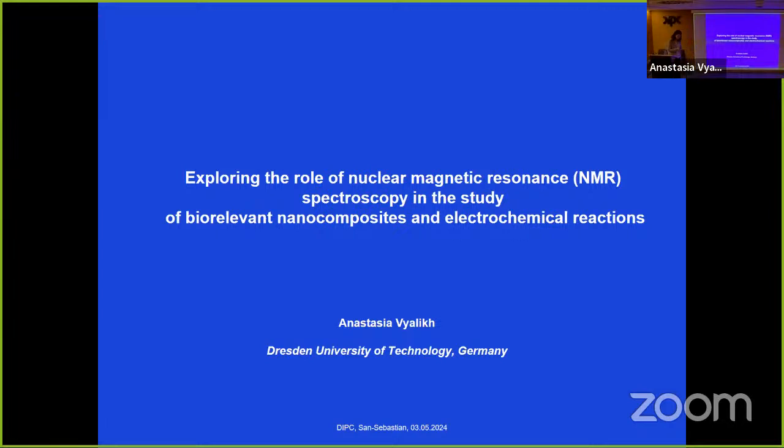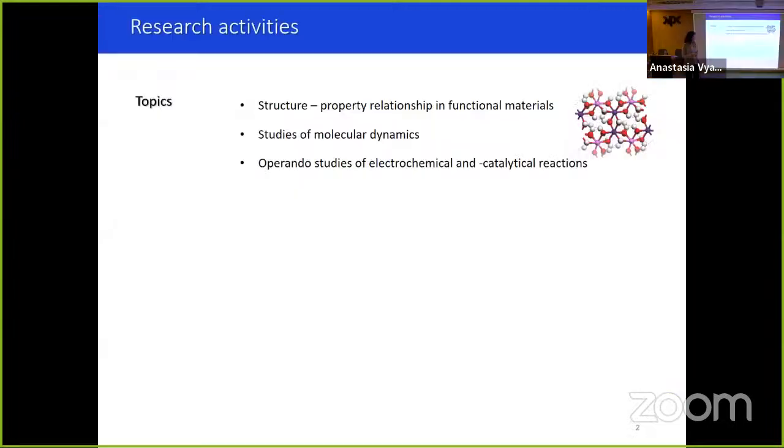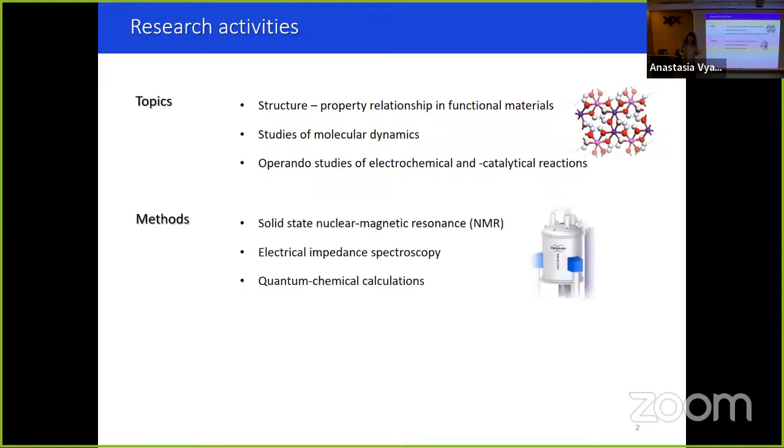I'm working, as Eugene said, at Dresden University of Technology, and here are just a few topics we are working on. The structure-property relationships in functional materials. We also work on studies of molecular dynamics and on operando studies of electrochemical and electrocatalytical reactions. The methods we apply comprise solid-state nuclear magnetic resonance, electrical impedance spectroscopy, and quantum chemical calculations in order to support our experimental observations.